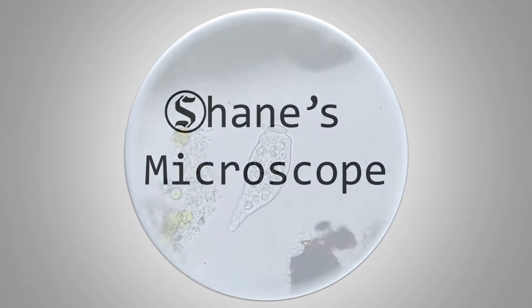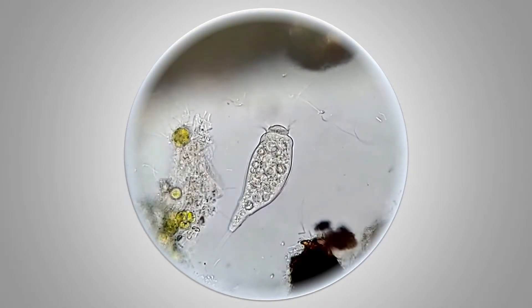Hello and welcome to Shane's Microscope. I'm Shane and this is my microscope. Let's take a peek.